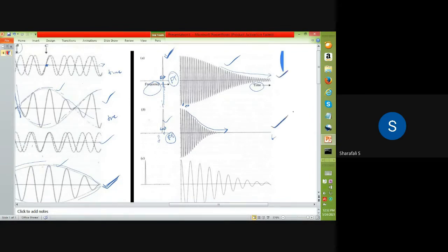For both these cases the frequencies are the same because we are considering the spectra at the same central frequency, but the width is changed. So when the width increases, the decay rate will be larger and the intensity of the signal will reduce very quickly when your spectral width is larger. But we are considering the same frequency, so both these signals will have the same frequency.